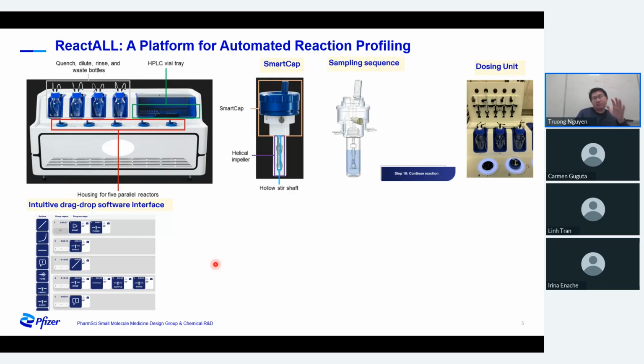And also we do process development. We care more about temperature, especially in scale up, because the reactors in the vial are very small. And if we put in a thermocouple, it's probably very packed. So Technobis has a very nice technology to get the temperature control without a thermocouple, just using IR technologies, which is really nice.